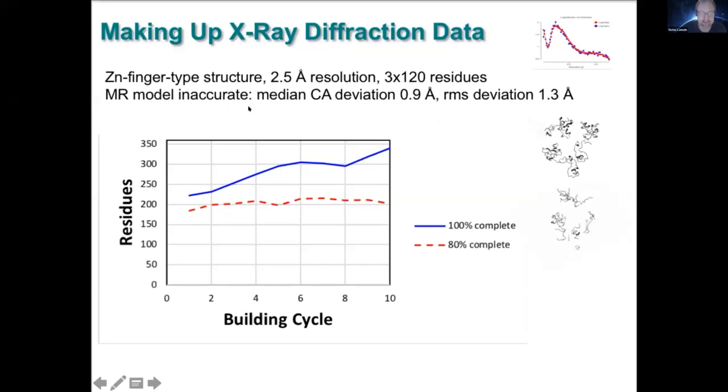George Sheldrick has then realized this in his software as the free lunch algorithm, and we tried to do something related in our work, which we call faking the data, by artificially extending it also to a higher resolution.